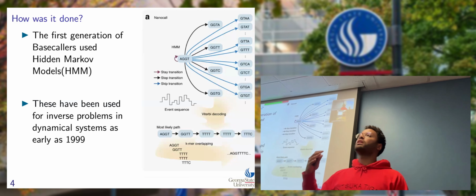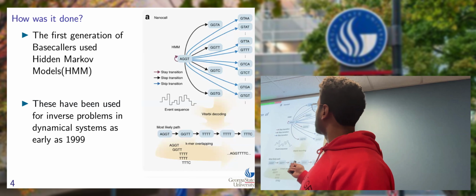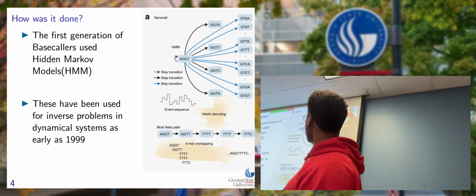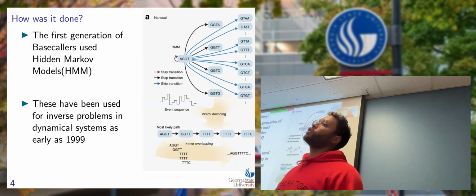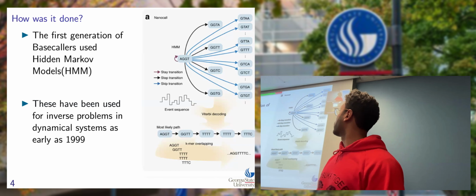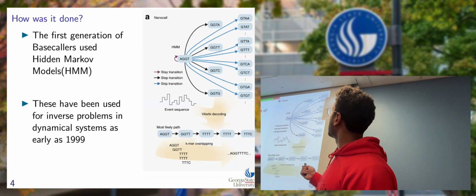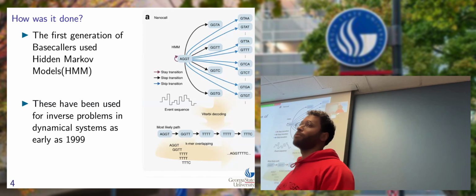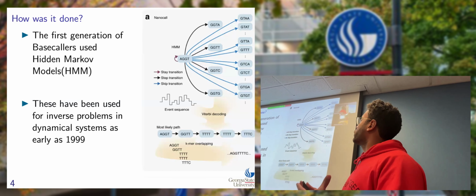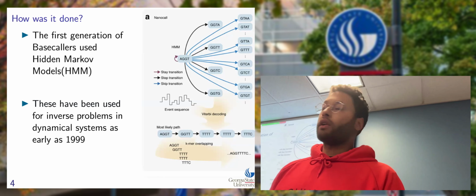So you have a single step transition, which is a probability matrix that has weights that decide how probable you are to go from here to here to here. So you have some weighted probability matrix that is the dimension of, well, not exactly your K-mer, but if you add up all these lines, that gives you more or less the number of cells in your probability matrix. Well, this is all good and well, but we're just getting started here.